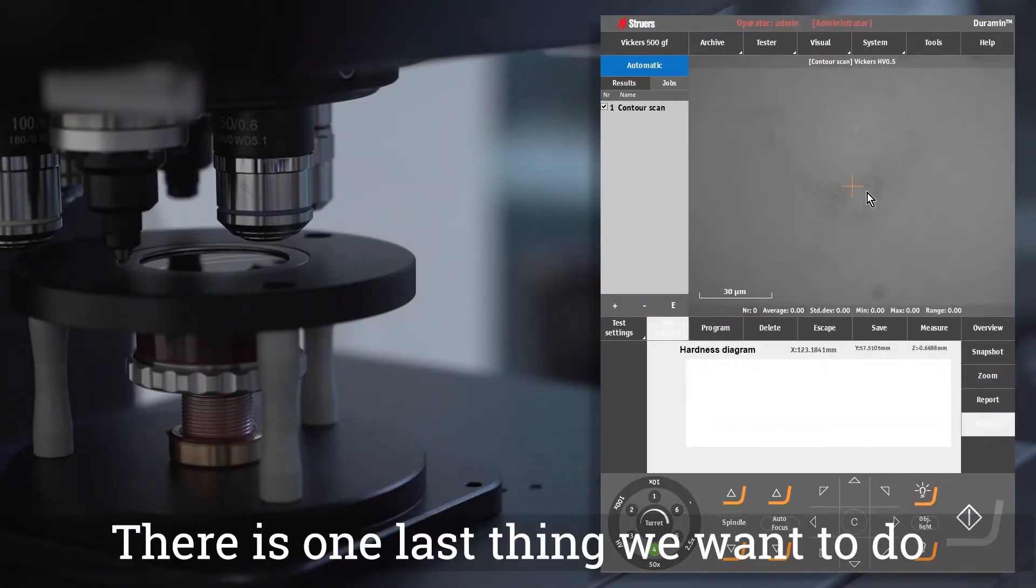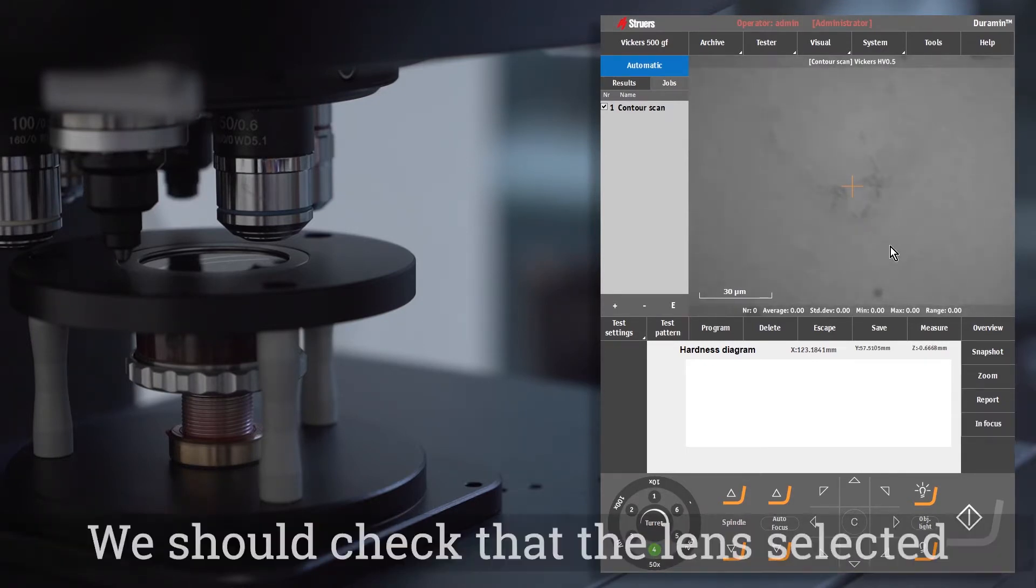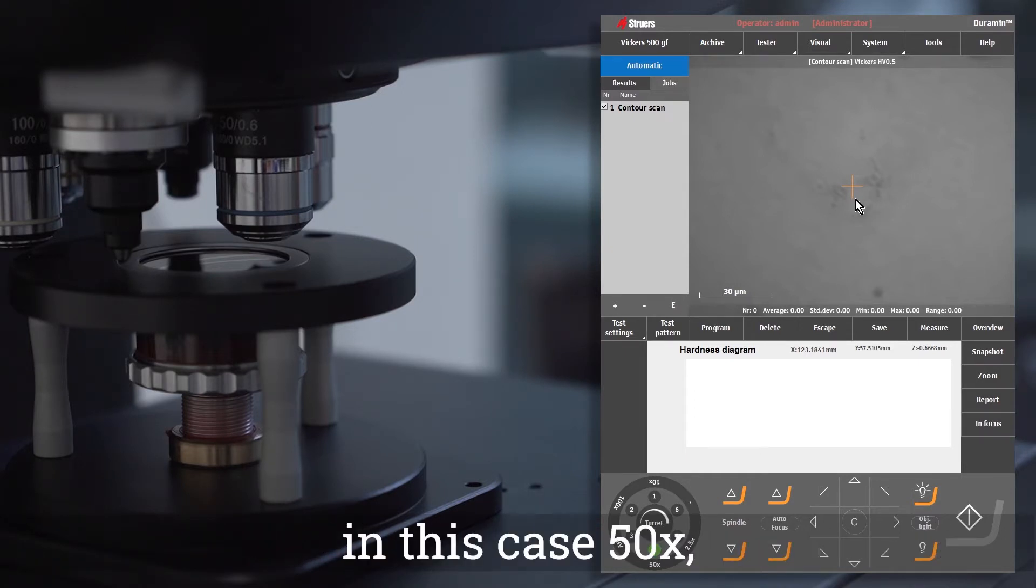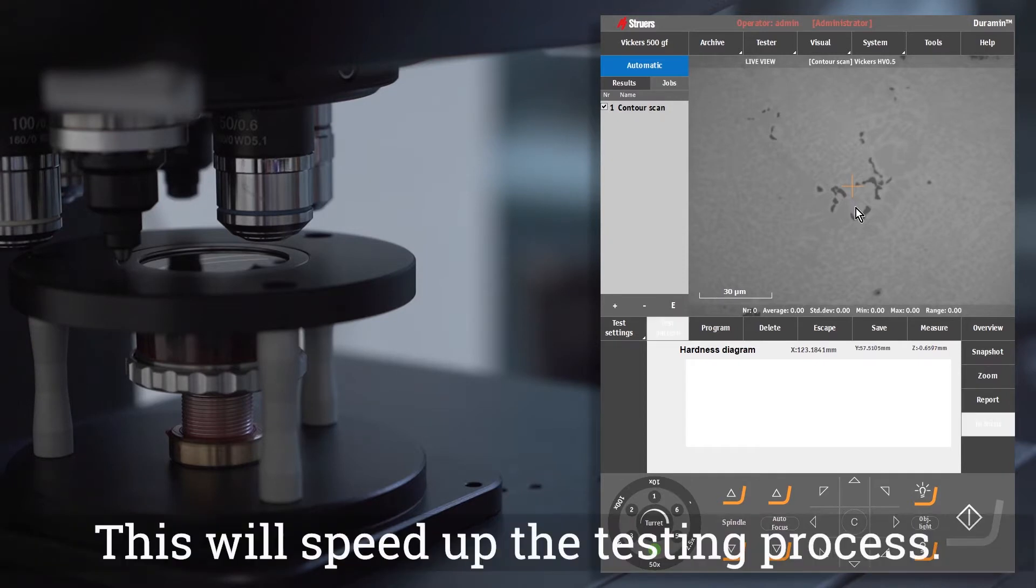There is one last thing we want to do before starting the test. We should check that the lens selected for indent measurement, in this case 50 times, is perfectly in focus. This will speed up the testing process.